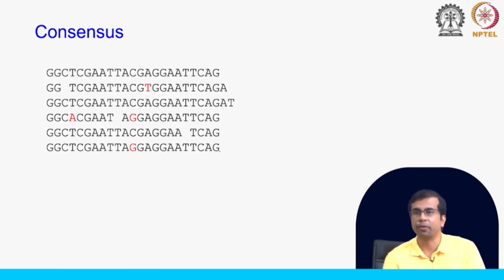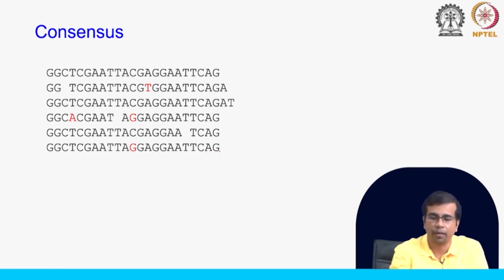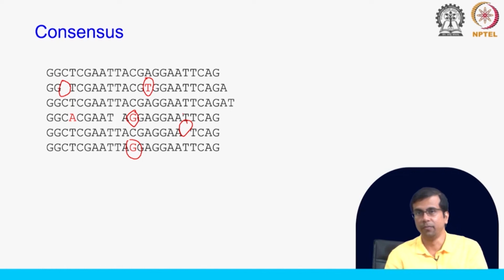If you think of a specific position, a small position, you have these reads that are aligning, and you can see that some reads show some mismatches. For example, you have this mismatch here or here, and in some cases you might also have deletions or insertions. Then what you have to do is determine the majority for each position in the read sequence.